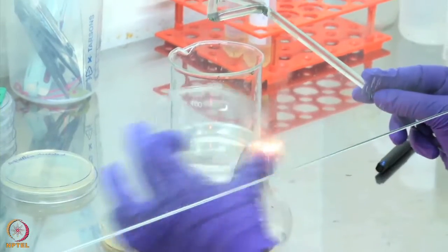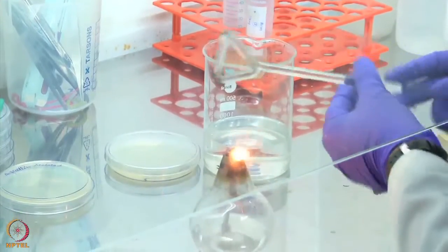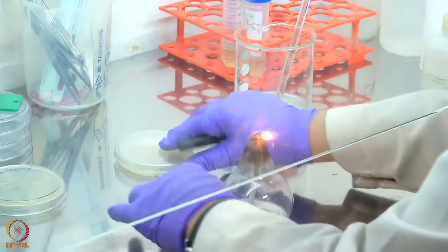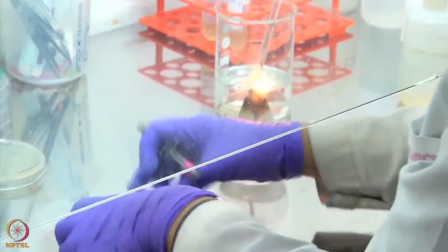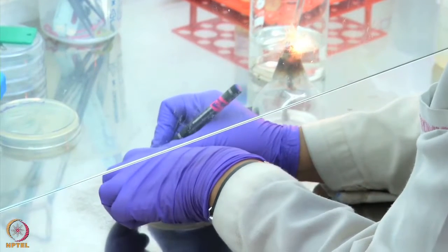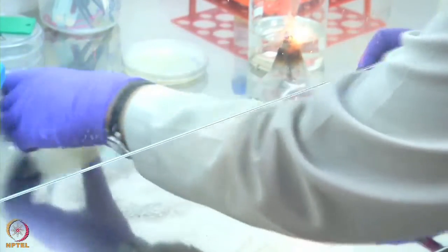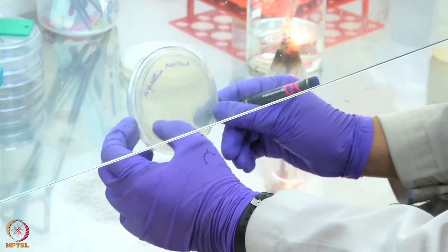I will show the lid some flame and I will keep it back. I will label my plate. Next, I will plate the negative control sample, which is nothing but water.